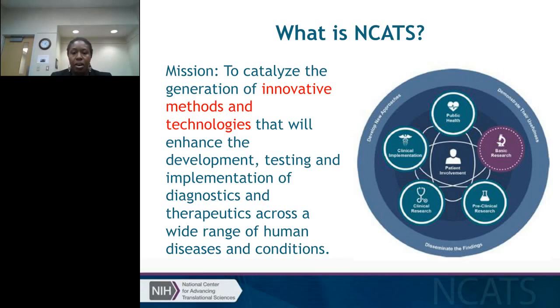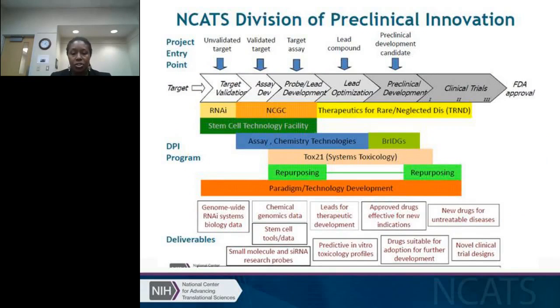And today, the talk that I'll be giving is really focused on the innovative methods and technologies development that we've done here. NCATS basically is structured as part of multiple groups. This is just your typical pharma pipeline, where you start with a target for your particular disease, and then from there you move down this line towards hopefully FDA approval. The group that I'll talk to you about today is really focused on working in the space around assay development, probe lead development, and lead optimization, leading up to preclinical development.